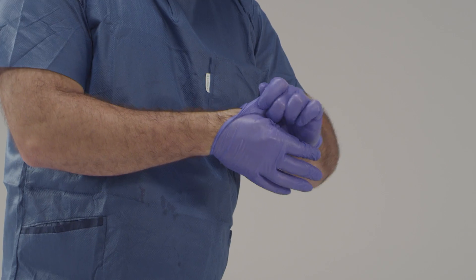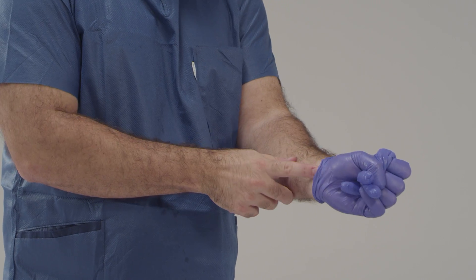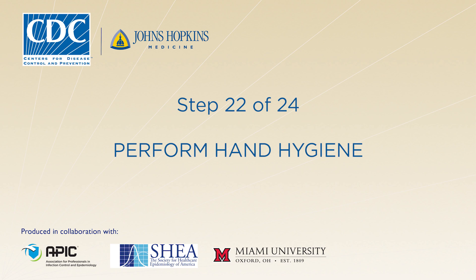Now we're going to remove your inner gloves. Be careful to do this slowly to avoid tearing the gloves or contaminating your hands. Once your gloves are off, it's very important that you don't touch your face, any exposed skin, or any surface in the room. Go ahead and perform hand hygiene.